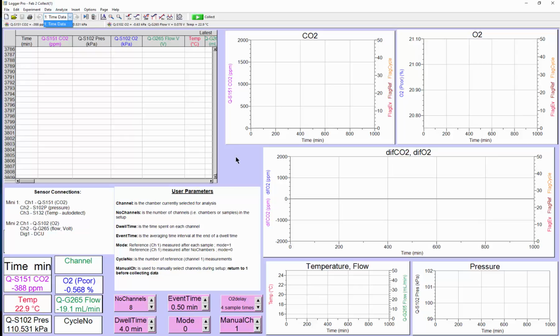collect setup file. The reason for separating collection from analysis was that in long experiments lasting many hours, there's a large amount of data and calculations. This will cause the Logger Pro updating of the graphs and tables to slow down after a certain amount of data is collected. Therefore, we have simplified the collection program to one page.